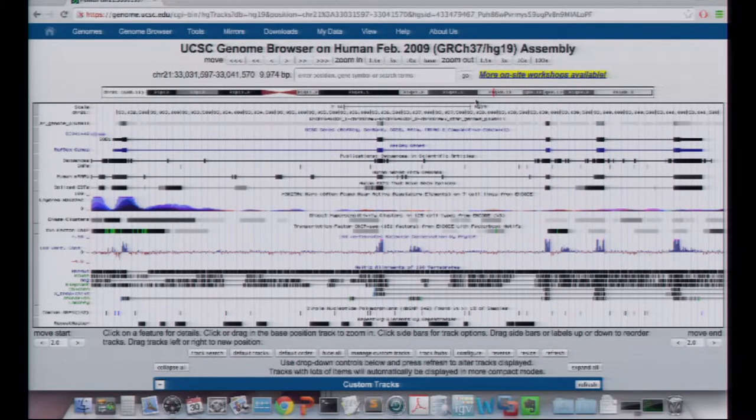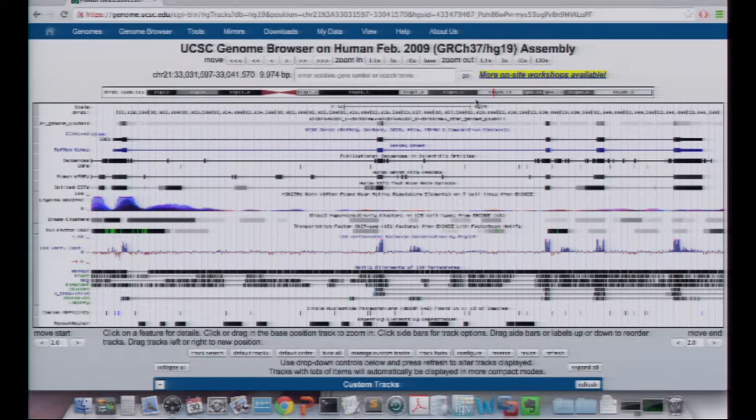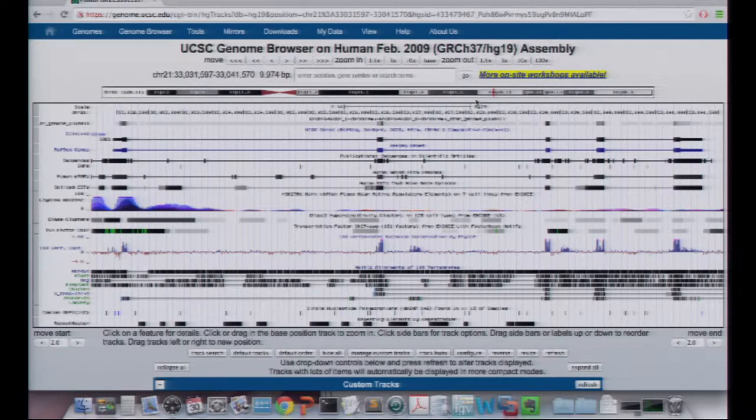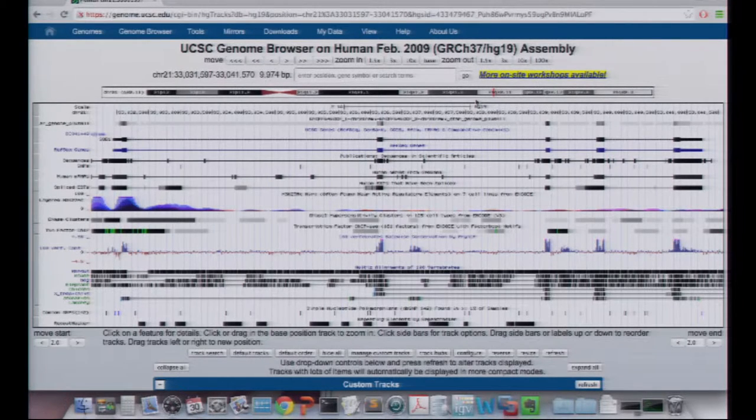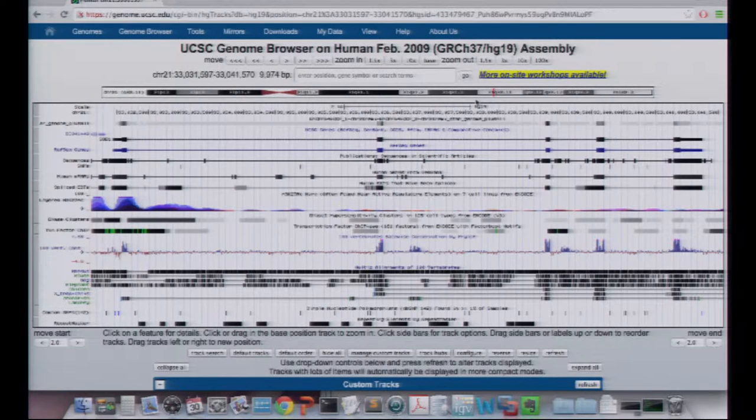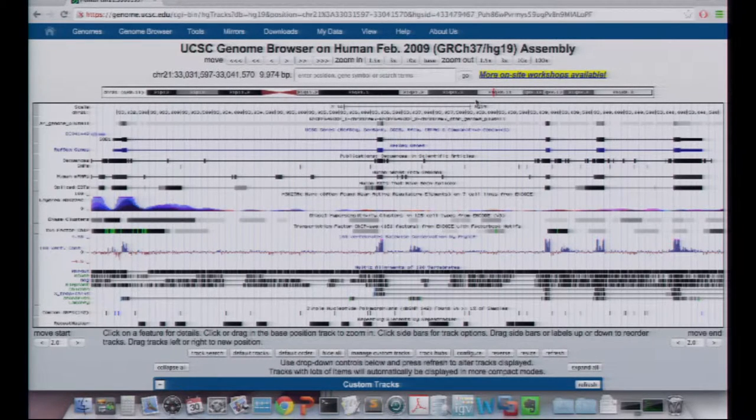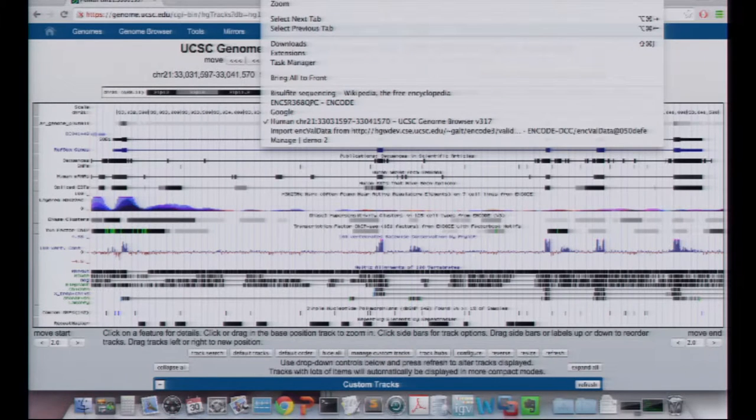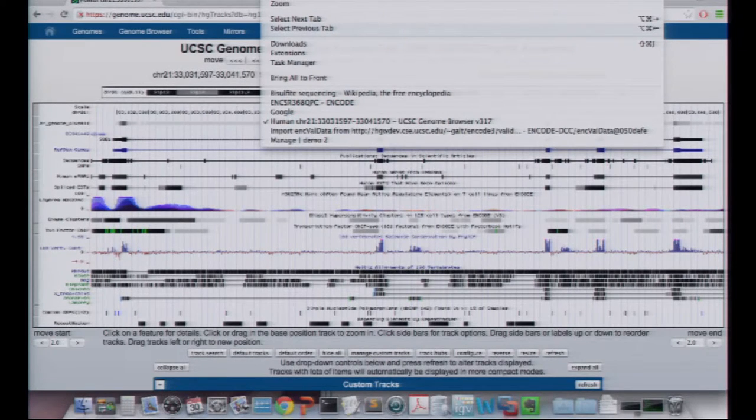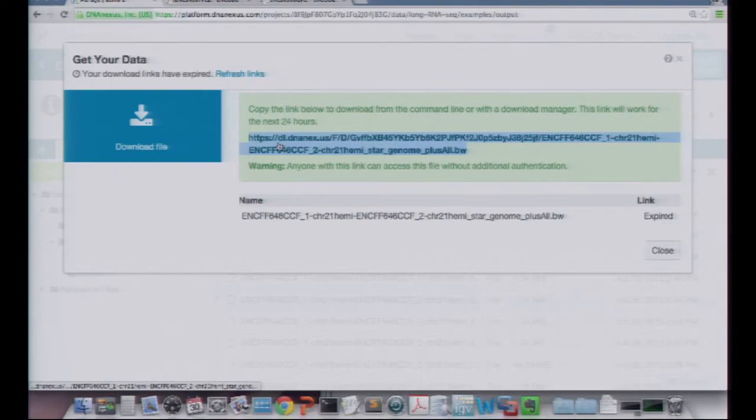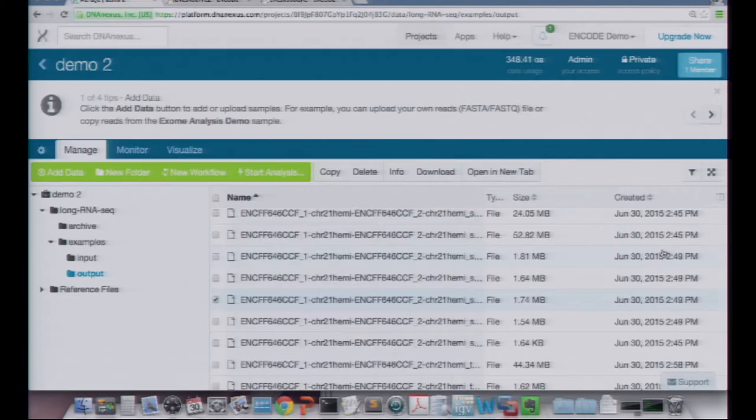Oh, so, I think what you want to know is you want to know what's the FPKM value for each gene that you calculated? Okay. So, that is from the RSAM output, the quantification files. I think I can show that pretty easily here. All right. So, this link is expired, so we'll close it. So, I'm going to go back to the, oh, look, it looks like my job is done. There's no number one here anymore. So, that means my job is finished. Look, it ran successfully.